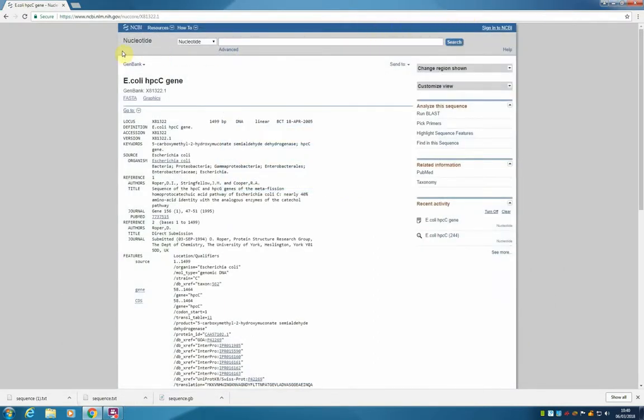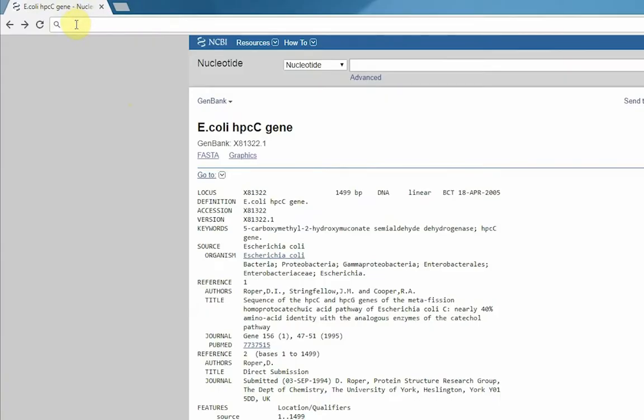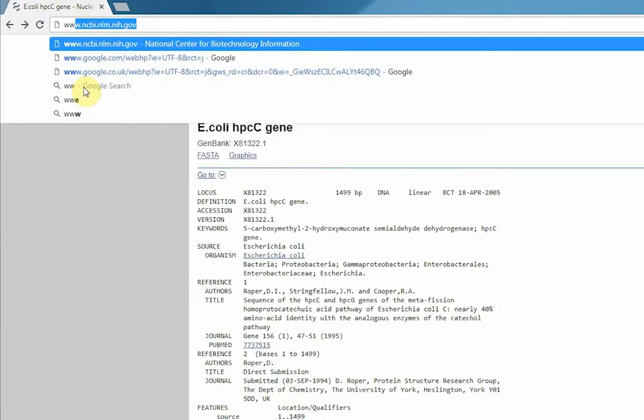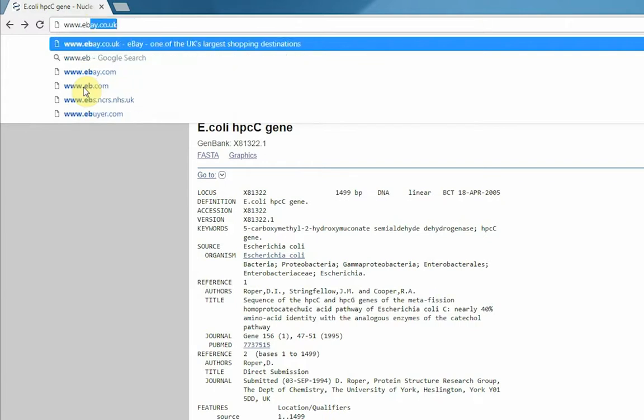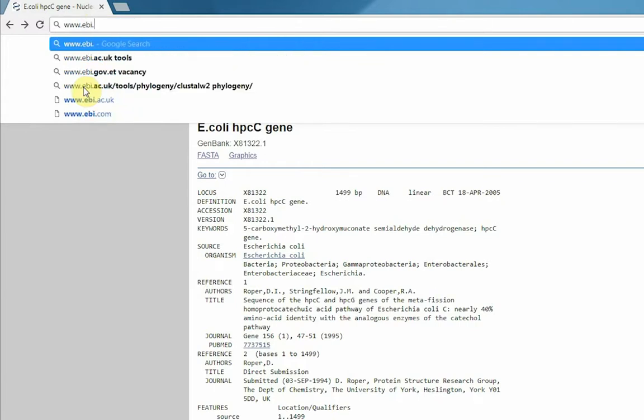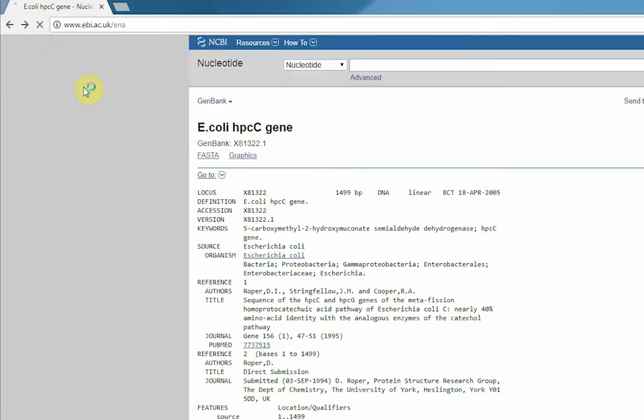We are now going to navigate to the European Nucleotide Archive website to have a look at the same entry in a different repository. We are going to retrieve the same gene entry from a different database. For that, we will navigate to the site by typing www.ebi.ac.uk/ena.